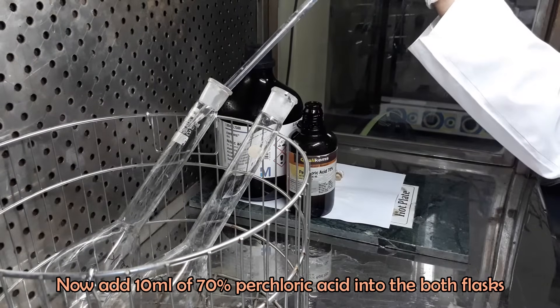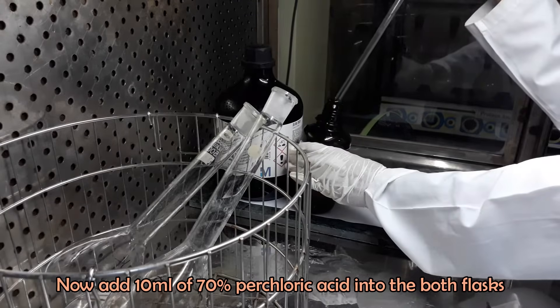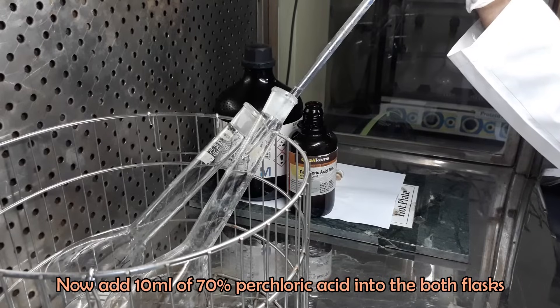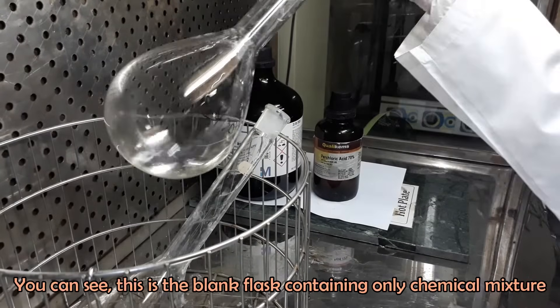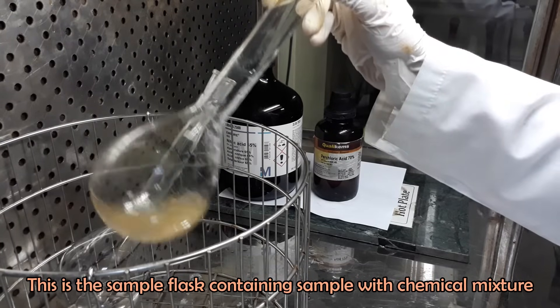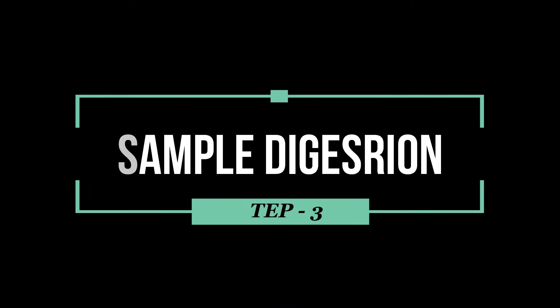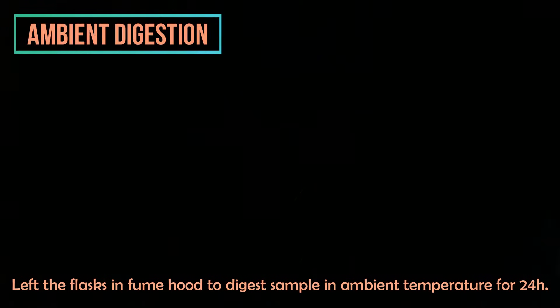Add 10 ml of 70% perchloric acid in the same way. Shake the flask slowly. Now keep the flasks in the fume hood overnight to digest the sample at ambient temperature.